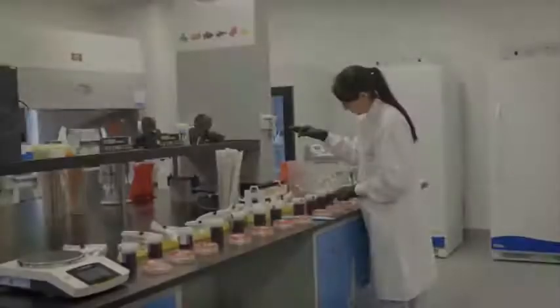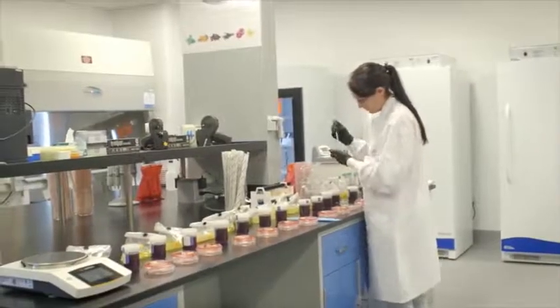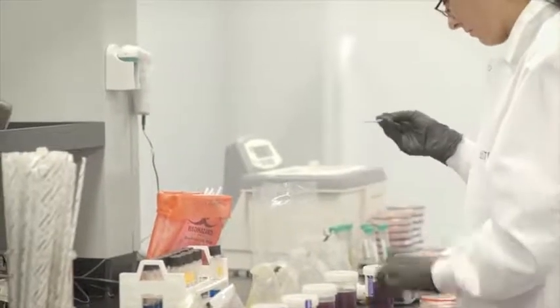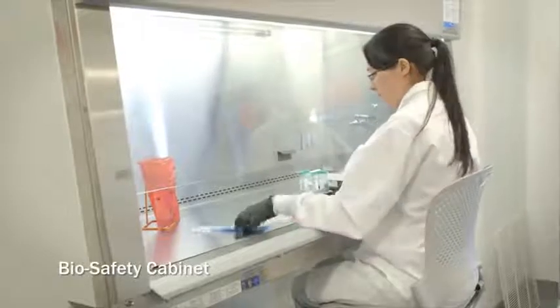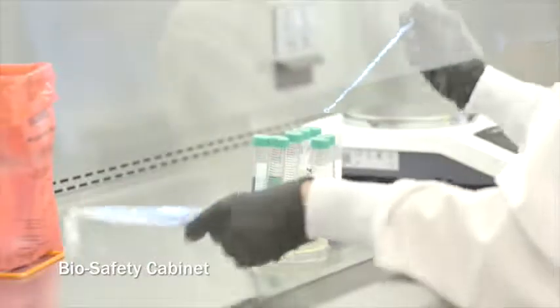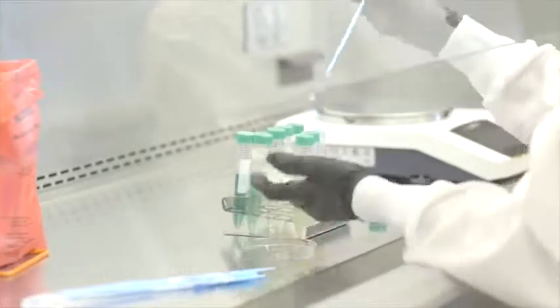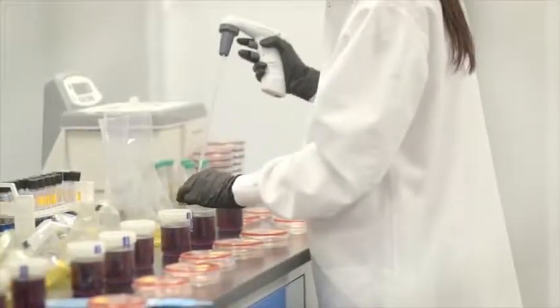Part of our contamination testing we have on our essential oils is each one will go through a variety of microbiology tests. In the microlab, we test for total plate count, yeast and mold, salmonella, E. coli, and Pseudomonas. The microbiologist will swab and plate each media, and then they'll actually count the plates using some specific microbiology techniques. From these tests, we can actually measure the contamination that has been possible in any part of the manufacturing process, all the way back to distillation.